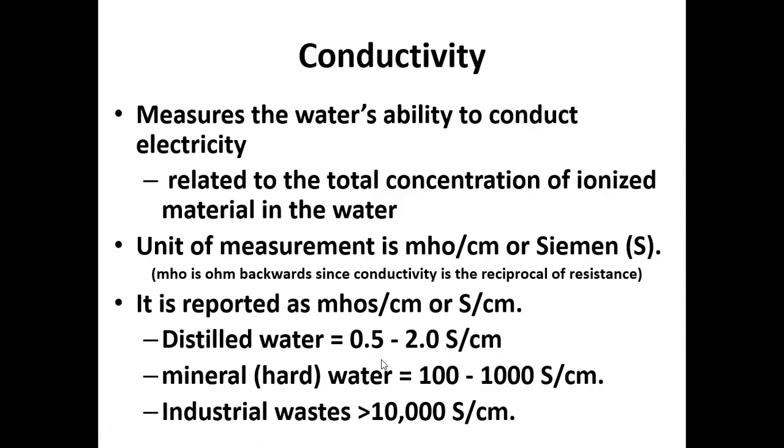Back to conductivity, it just measures the amount of dissolved ions in the solution. And ions can be important for the things that live in the water.